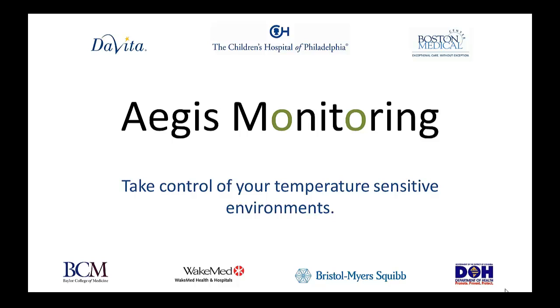My name is Ryan and I'm the product manager. You may recognize some of the current customers we have. The things that we monitor are temperature, humidity, CO2, power, pressure, wetness, light. We also have visual and audible alarms.